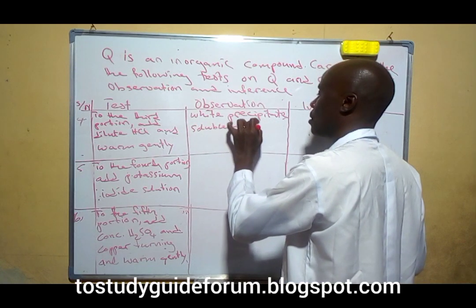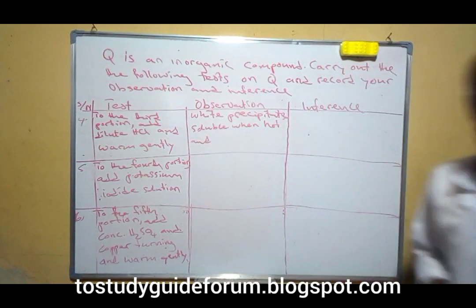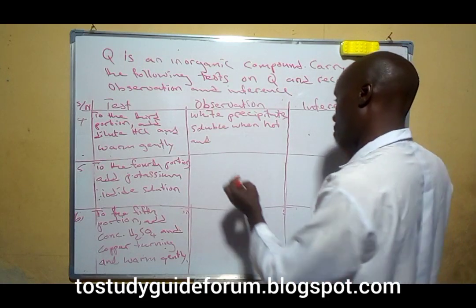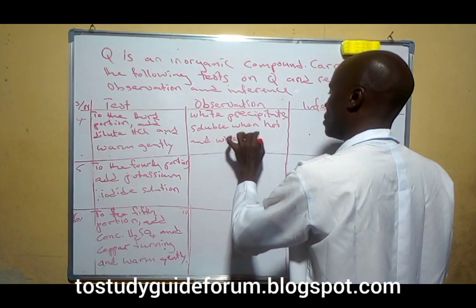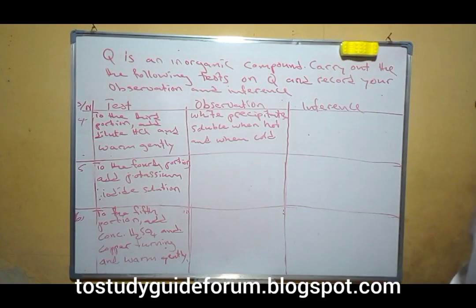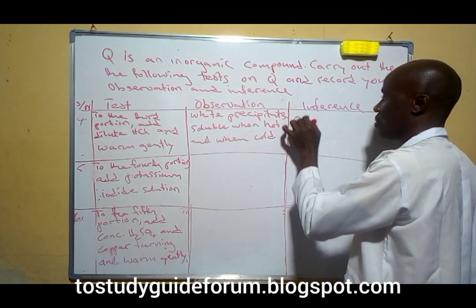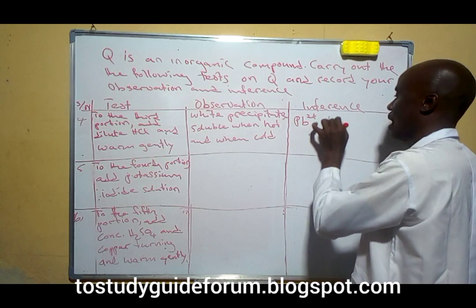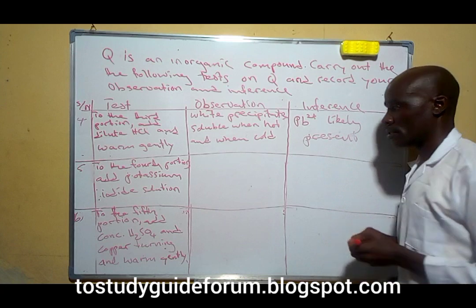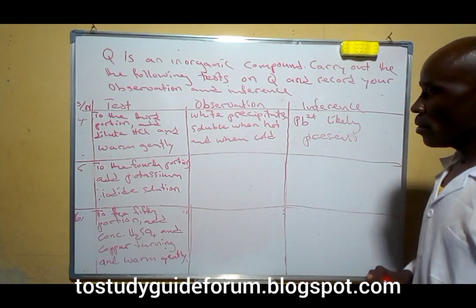It is soluble when hot and insoluble when cold. What we have there means that lead(II) ion is likely present.